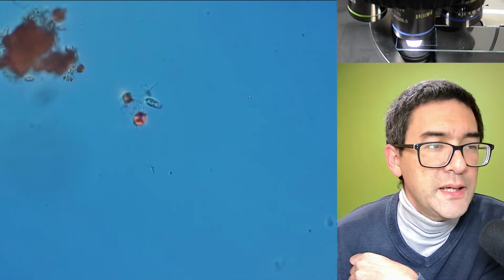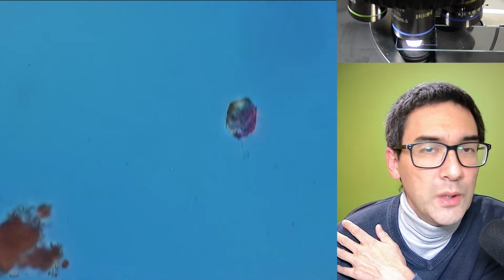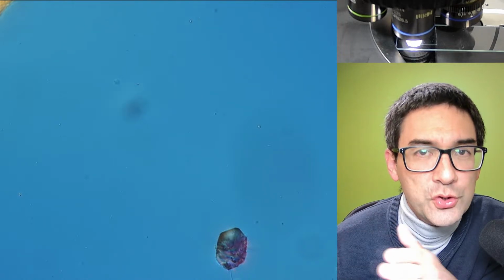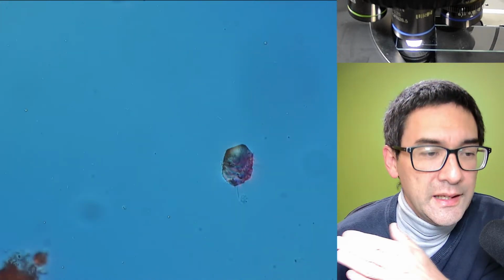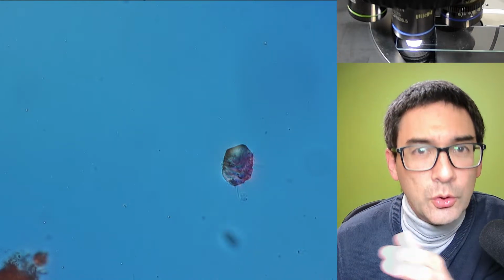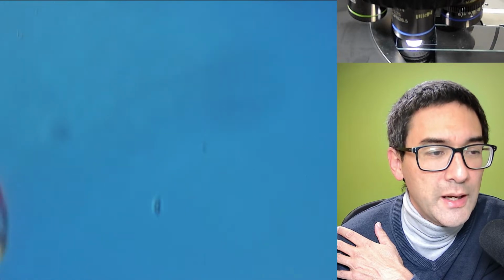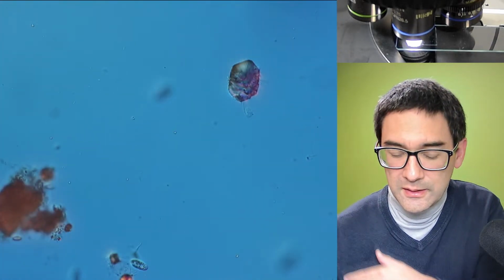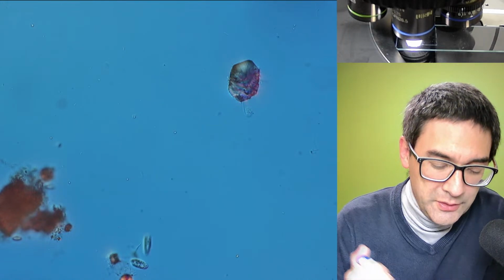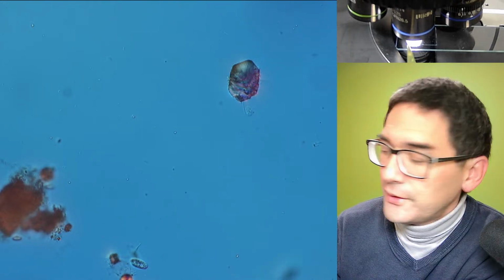But what we can try is, when I apply some of this spice on one edge of the cover glass, it will start to form a concentration gradient. And if they don't like it, then they will actually move away from the concentration and will move to one side of the cover glass. So, that's actually something that I would like to try. Okay, so let's try this, we have to make sure that we take a small amount here. And now I'm going to try to apply it to the edge of the cover glass.